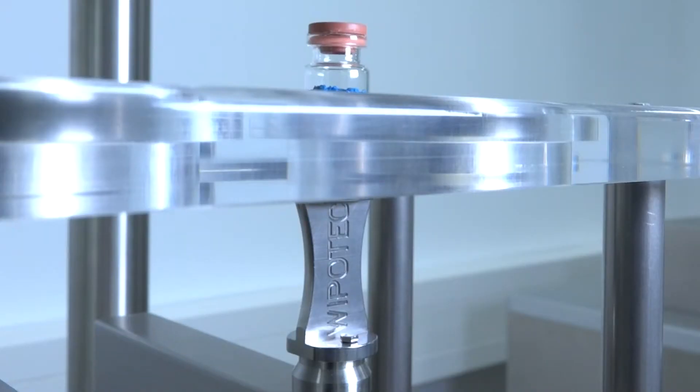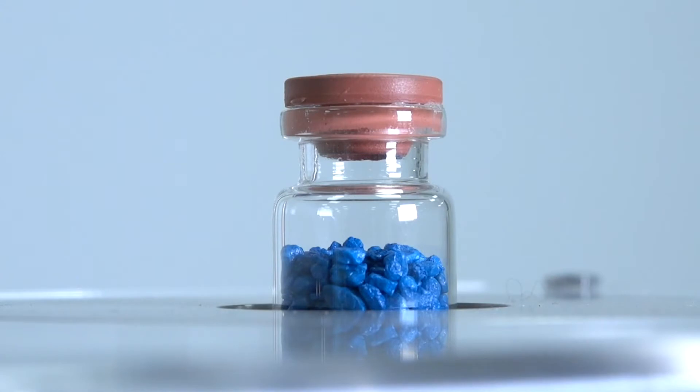We have the weigh cells and solutions for your filling process in pharmaceutical environments. In particular, when we're talking about vials — for example, here we see a solution. An answer I receive very often from mechanical engineers and machine builders is: yes, cylindrical vials can be lifted up for weighing. It is possible.